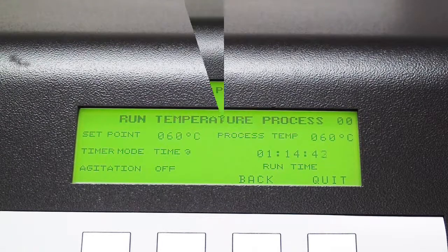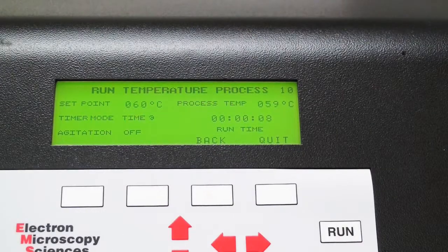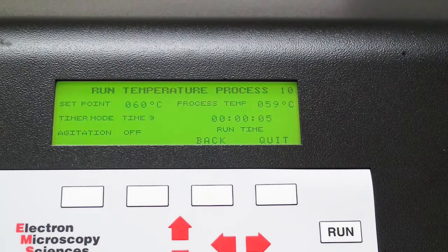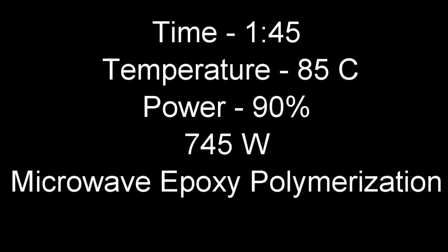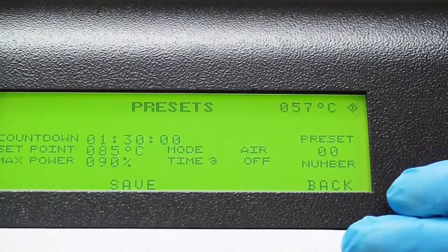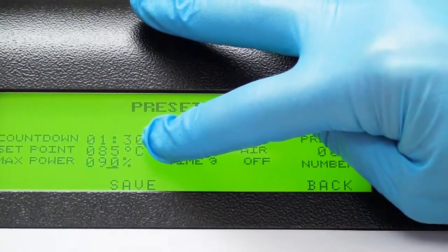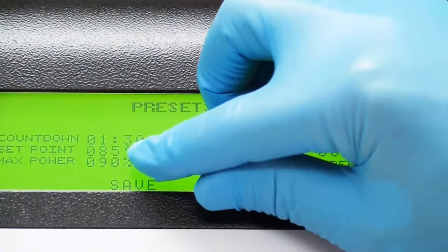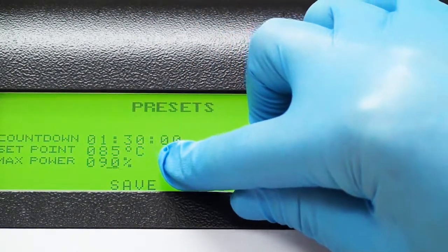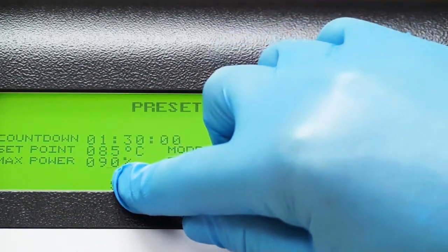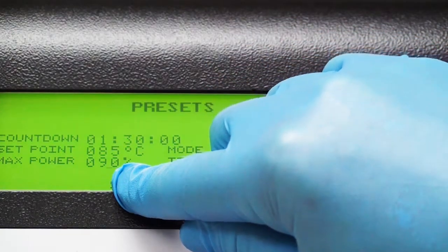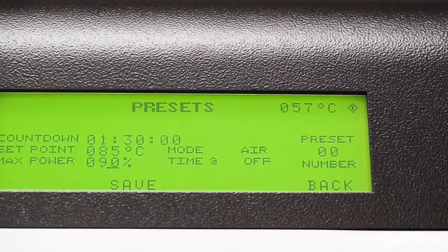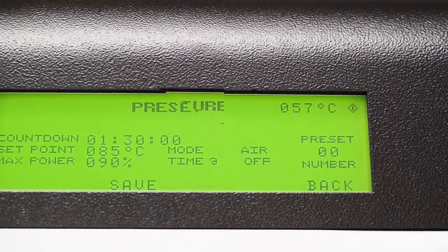After this is done, I need to do another secondary polymerization. The 60 degrees for 1 hour and 15 minutes isn't enough. So now I'm going to do 1 hour, 45 minutes, 90% power, 85 degrees centigrade, which comes out to be 745 watts. I see now I have 1 hour and 30 minutes in there, and it should be 1 hour and 45 minutes. So I'm going to change that. I have 85 degrees C, 90% power, which relates to the wattage of your microwave. Let me change that number again. And now we're going to get going.